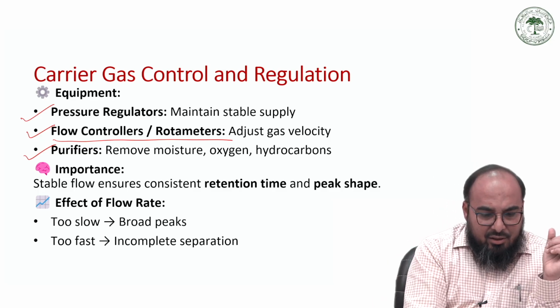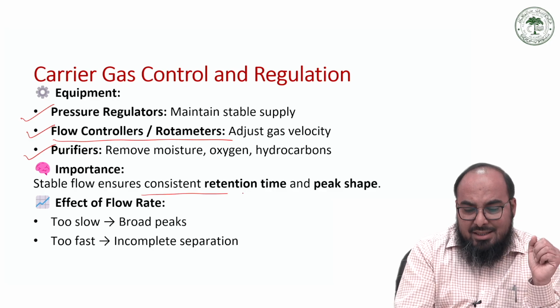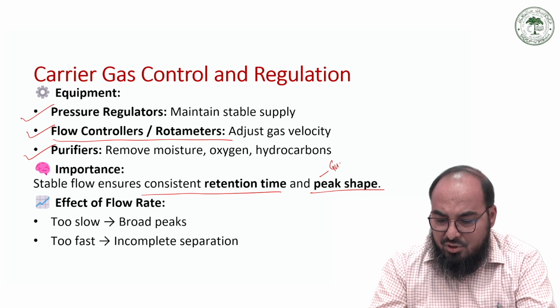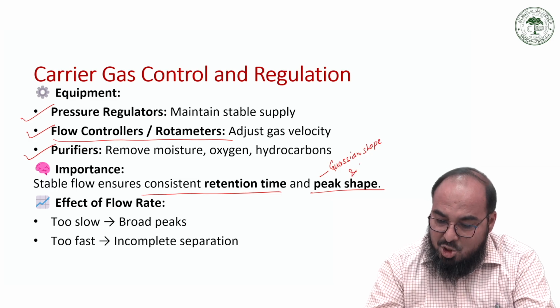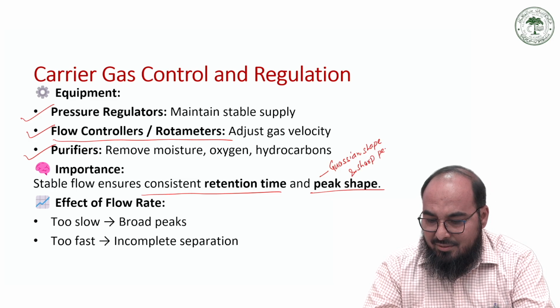Why are they important? Because they ensure consistent retention time and peak shape. Ideally you have a Gaussian shape and sharp peaks. We have already discussed it.